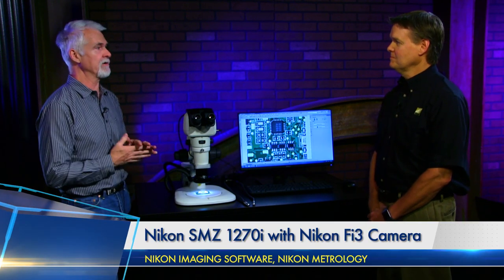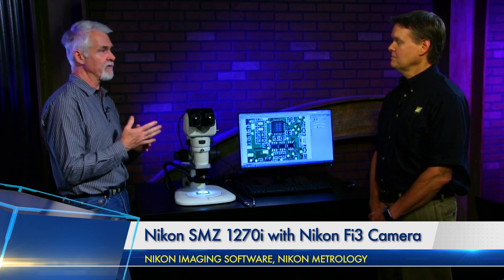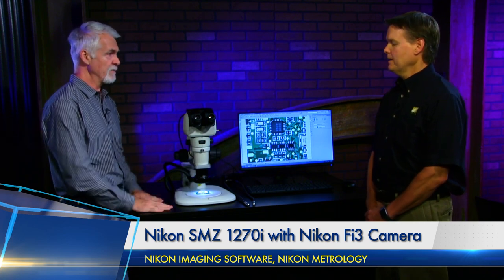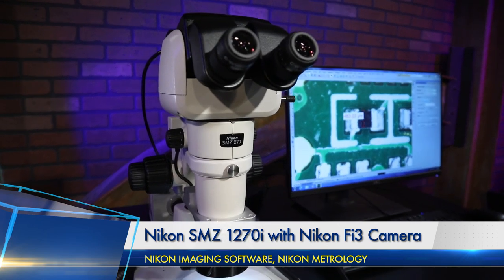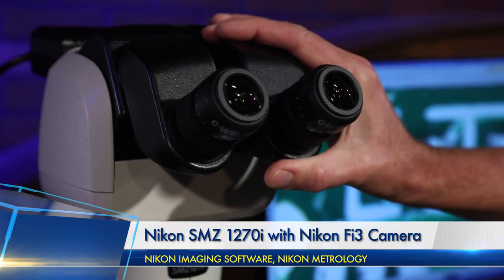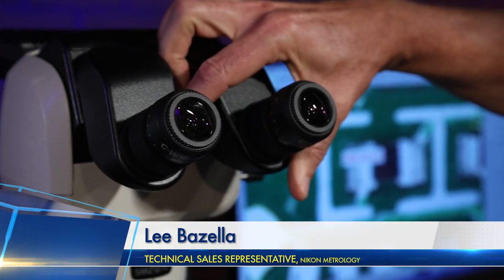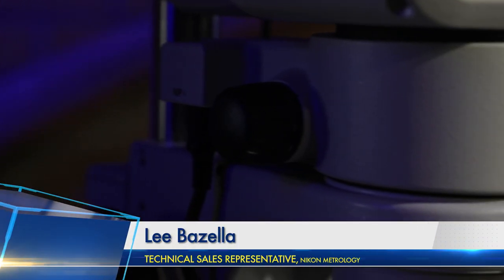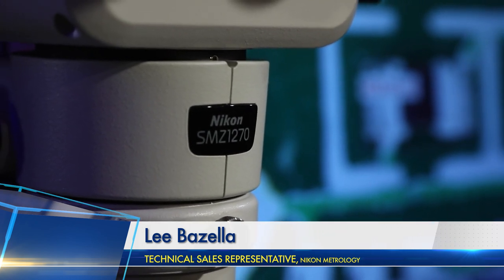We're going to look at one microscope out of a series of stereomicroscopes from Nikon Metrology. We have a SMZ-1270i. It's one of a range of about six stereoscopes that we offer. It's kind of mid-range—we offer some with a larger zoom range and some with a smaller zoom range. The 1270 means it's a 12.7-to-1 zoom ratio.